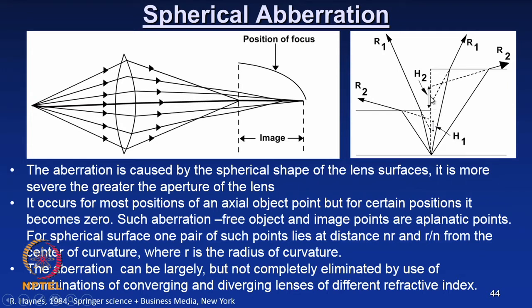Obviously, the quality of the image will be much affected because of this optical path difference between a standard cover slip thickness versus an arbitrary cover slip thickness.